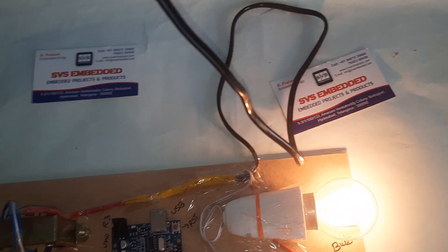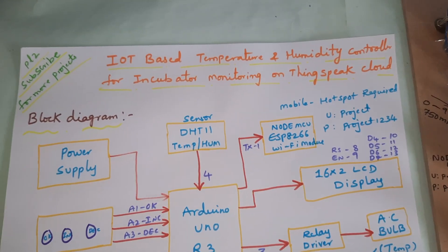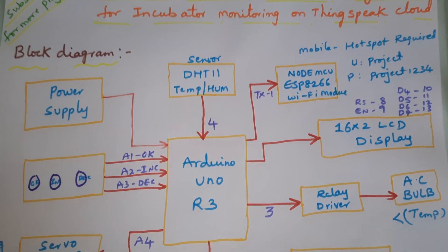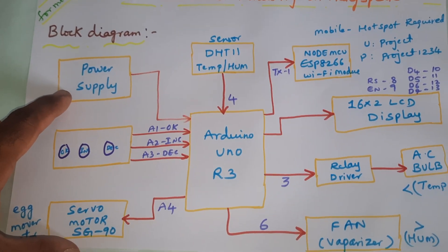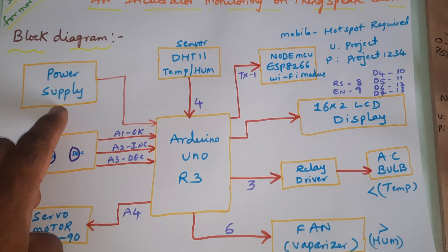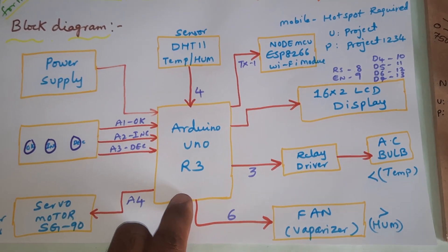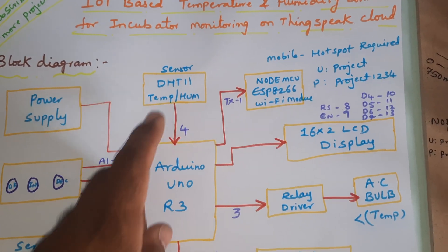Hi, we are from SVS Embedded. The project title is IoT-based temperature and humidity controller for incubator monitoring on ThingSpeak cloud. In this project we are using a 5-volt power supply module, Arduino Uno R3, and DHT11 temperature and humidity sensor.